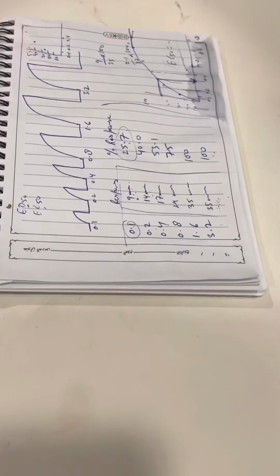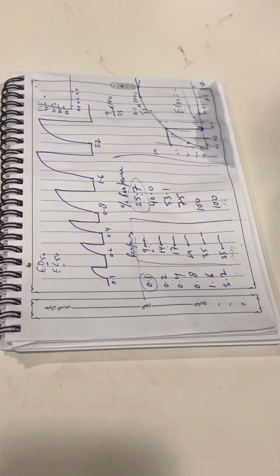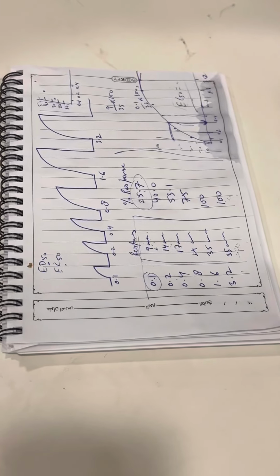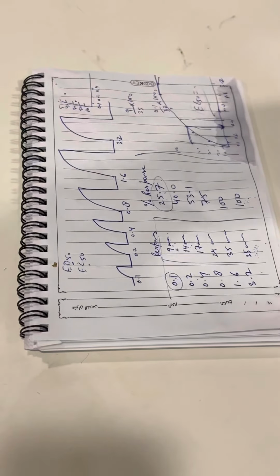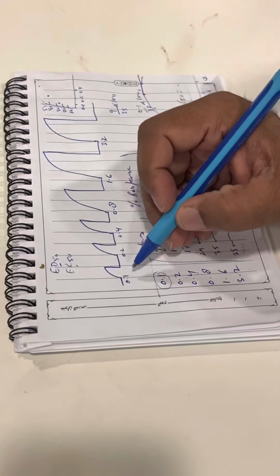When you administer it, this acetylcholine will bind with the receptor present on our ileum, and then it will give the response as a contraction. When you administer maybe 0.1 ml acetylcholine, it will bind with the receptor, cause contraction, and give the response like this. I will show you on the laptop.